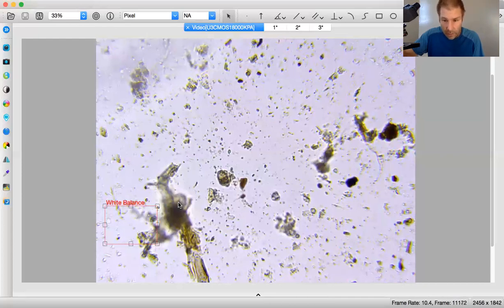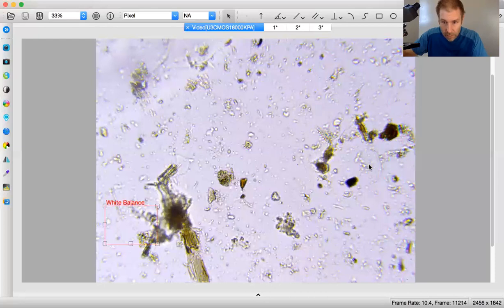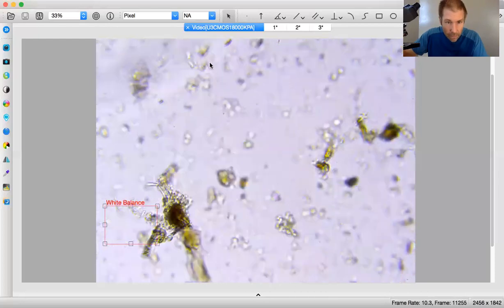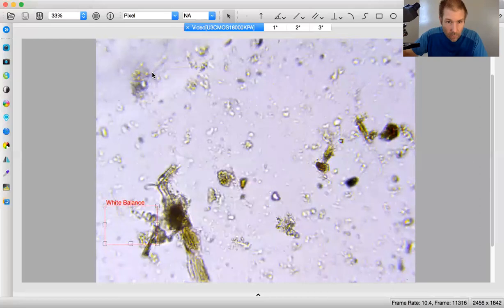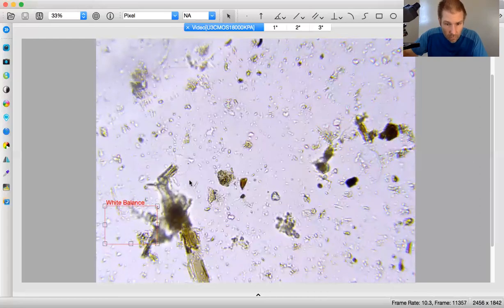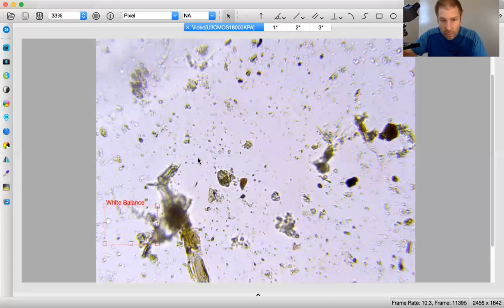So moving forward, this is reading area number 1, field of view 5, sorry. Got some actino right here. Definite actino right here. That's what we're going with at the moment.